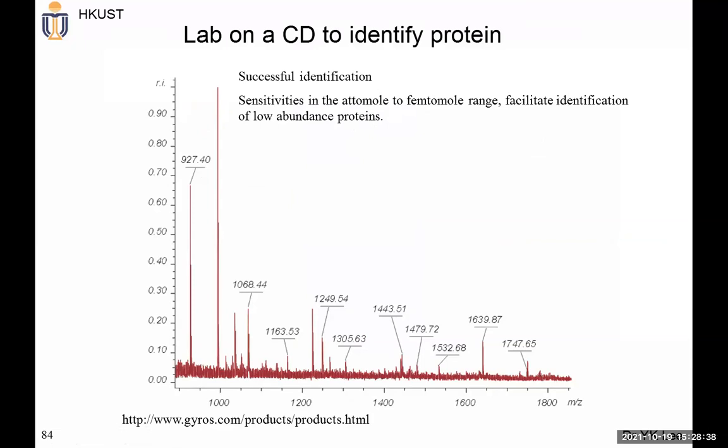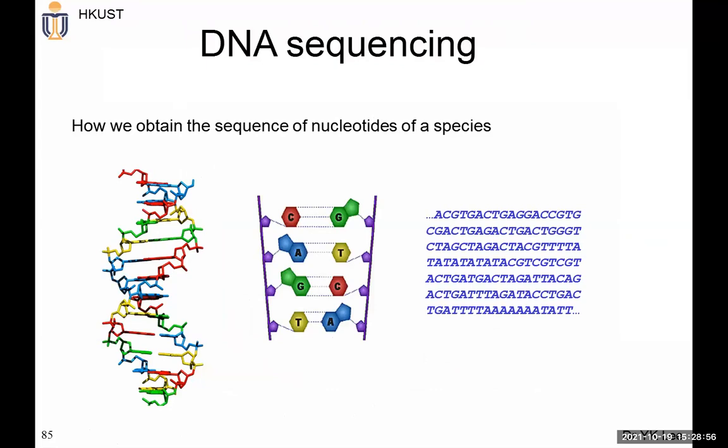We briefly mentioned traditional microchannels, glass microchannels, droplet based and electrowetting based microfluidics, and also electrokinetic microfluidics. Lab on CD is another branch, inertial based microfluidics. And gradually people really think about it.